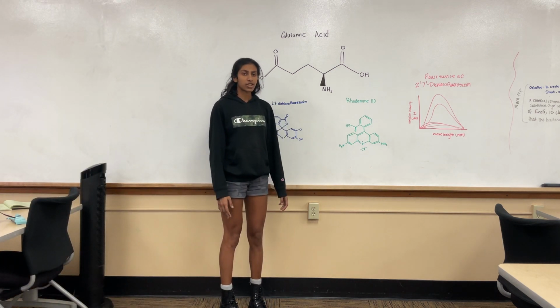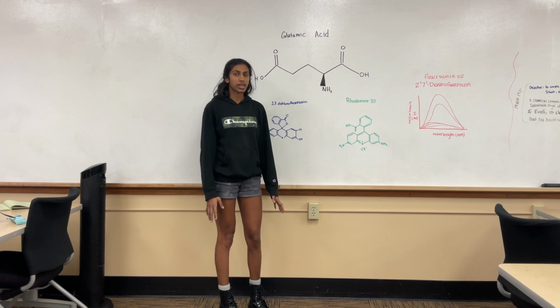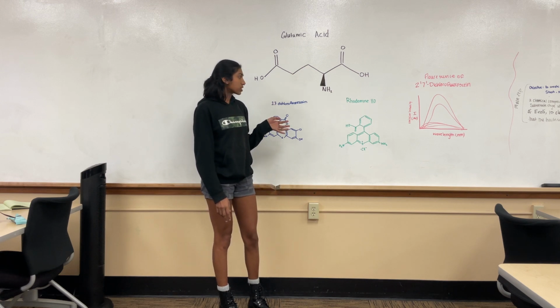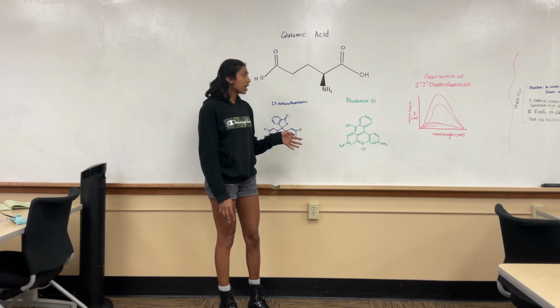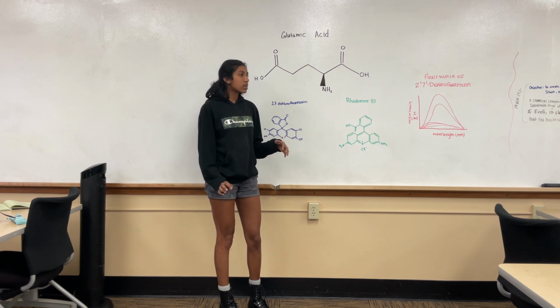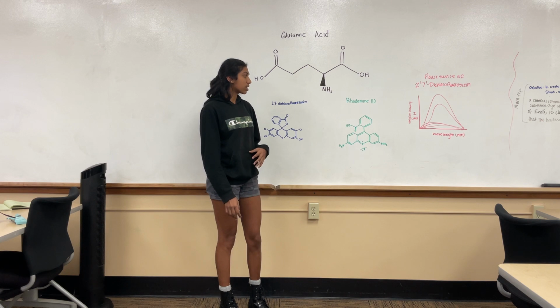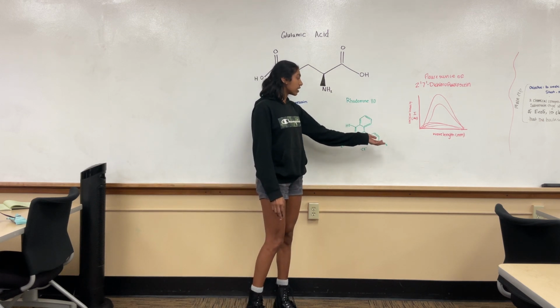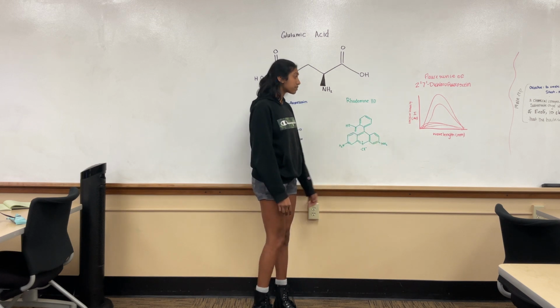When we measured our solutions in the fluorometer, we came up with 4 graphs: an absorbance versus wavelength and a fluorescence versus wavelength for both 2,7-dichlorofluorescein and rhodamine 110. We compared the fluorescence versus wavelength for both compounds, and we thought that this was the most significant graph in helping us establish the purpose of our experiment.